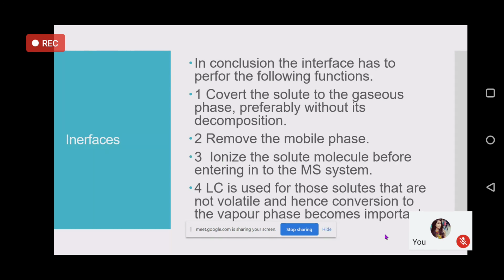If they are able to undergo fragmentation in a different manner, the usual enantiomers or optical isomers, if they undergo fragmentation in a different manner, then only the fragments can be used to identify and ascertain that yes, we are able to separate isomers. Otherwise, it is not possible.